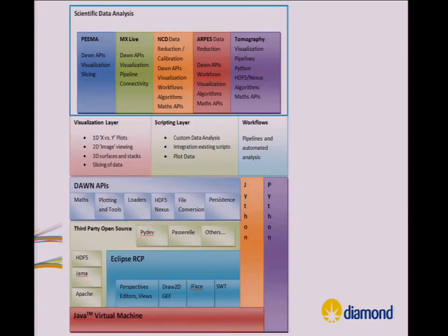That's some of our architecture as well, put out in colourful block diagram form. That's on our website if you want to see it in more detail. You see that we use Python and Jython, mostly CPython. For analysis, the scientists are going to be using things like NumPy and SciPy, which are very popular for the scientific layer.